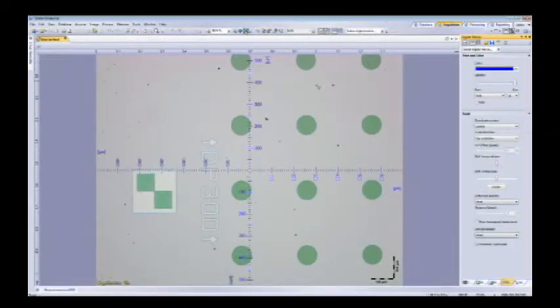Oh, that's cool. A lot of customers ask for this, where they can be on a live image like we are. Now, this scales as you change zoom factors and so forth, or lenses? Exactly. If you're integrated with the microscope, which our software does with a lot of our scopes, like this one here with a coded nose piece, as soon as you change objectives, it's going to modify and change the scale on the screen.